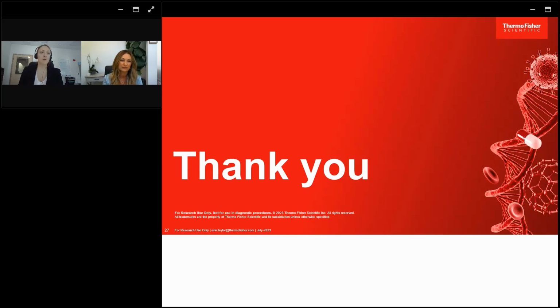Yeah, so the regular Attune doesn't have any imaging. So unless you actually have the Attune CytPix and can acquire the images, you wouldn't be able to. We have the NXT, which is the one I think that a lot of our users will be more familiar with. It's been available for quite a while. And that one is just the regular fluorescence. And then the Attune CytPix collects the exact same data as the Attune NXT, but it also collects the imaging. So you would have to have the Attune CytPix. And then I'm sorry, what was the other part of the question?